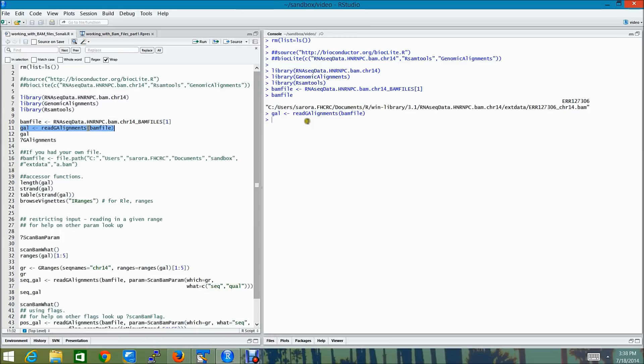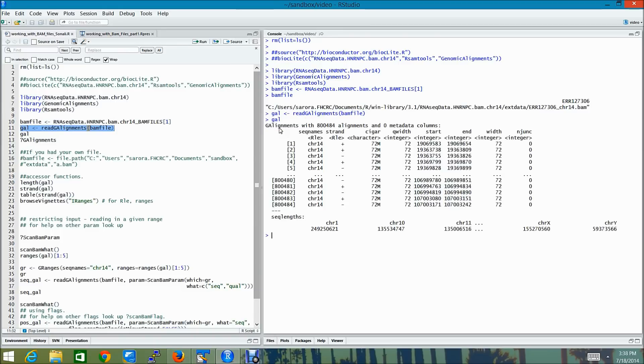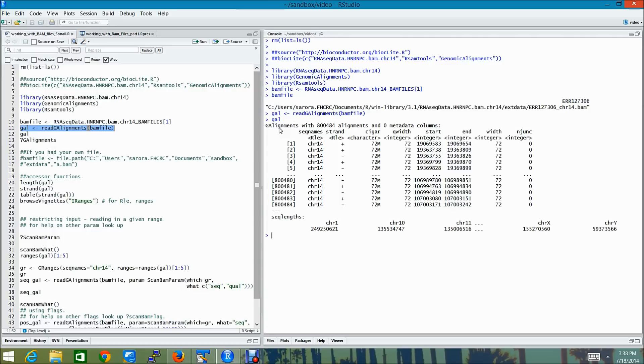Now gal is actually a g-alignments object which is nothing but a vector-like object where each element describes a genomic alignment, that is how a given sequence, typically called query or read, aligns to a reference sequence which is usually long.